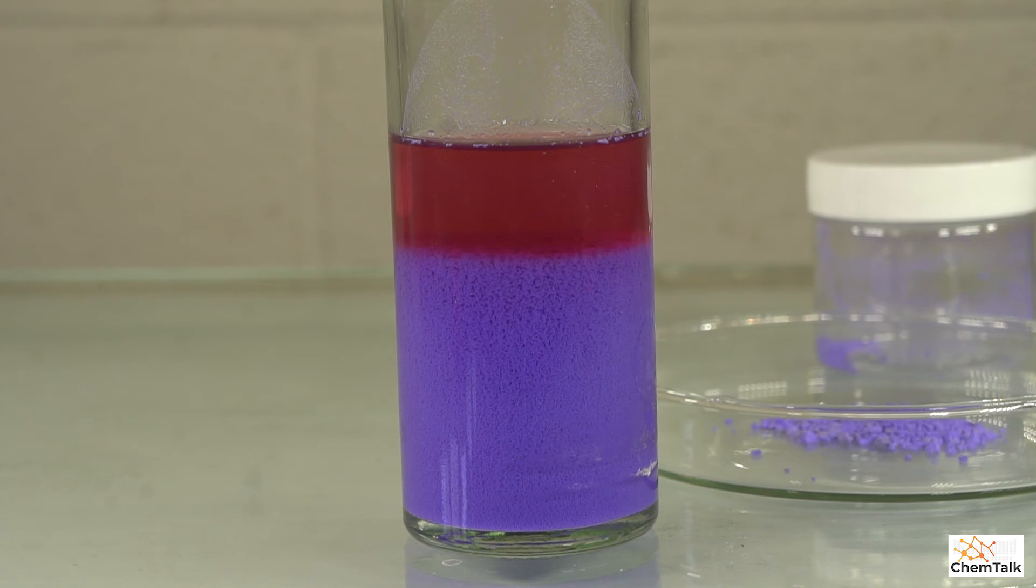And as soon as I did that, the purple precipitate settled to the bottom two thirds of the container. And there's still some cobalt sulfate in solution, which is why you see the reddish color at the top.